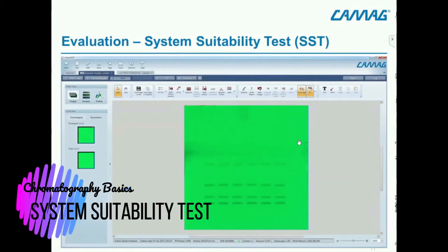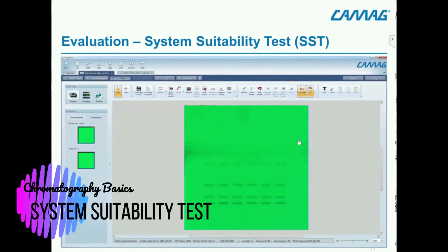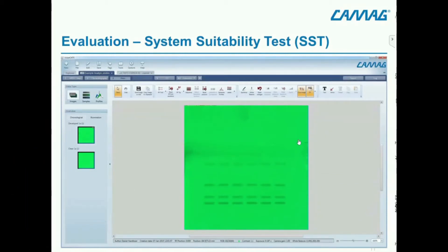The next topic is about system suitability tests. We will now change to the evaluation — how to ensure that the chromatography was done in the right way and that we have reproducible results. For this purpose, we have the system suitability test, which can be part of the method but can also be done afterwards.